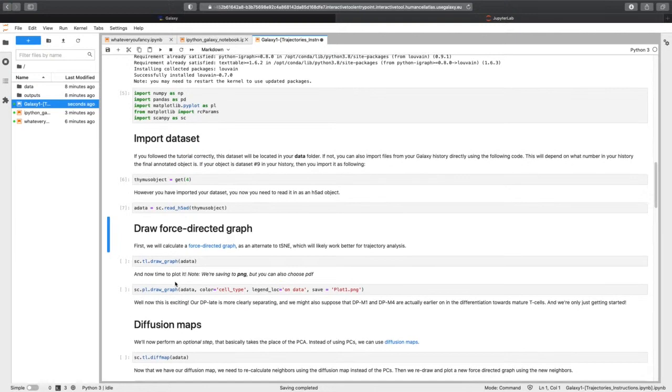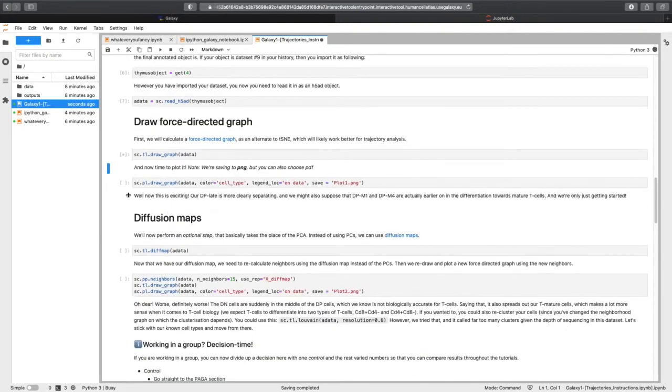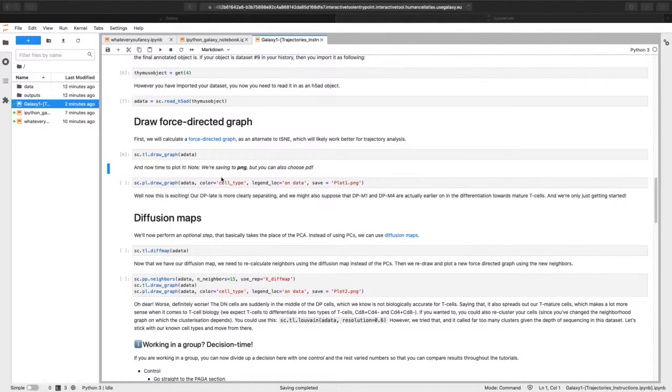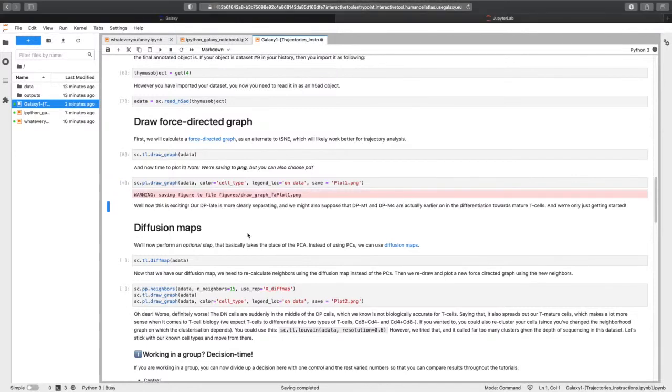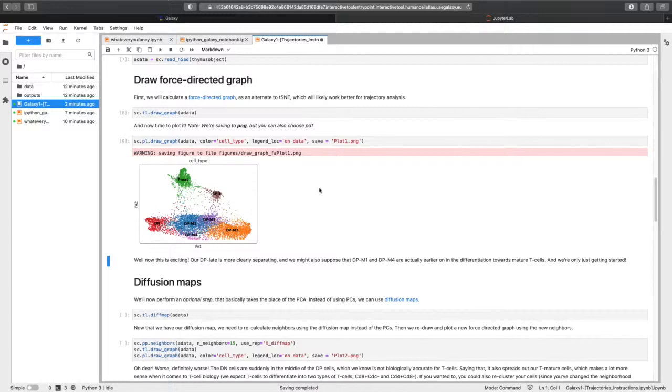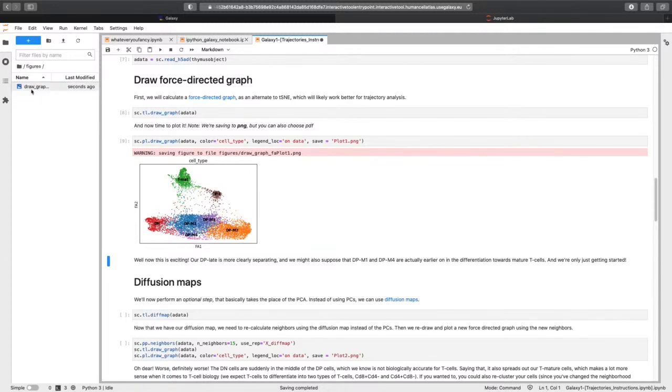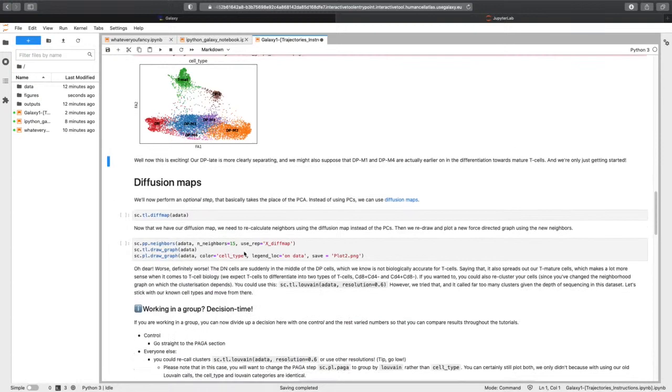And now we need to read it in so that it understands the object that we're working with. Creating our graph coordinates with the force directed graph. And we're back. Okay, and now we can do the fun bit, which is plotting it. And you'll also notice it has the save output as well. So we're going to be saving our images. Figures, there we go. So it's creating a little folder of these images as well.